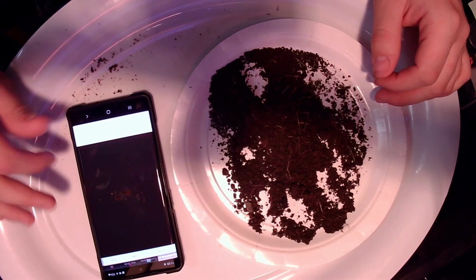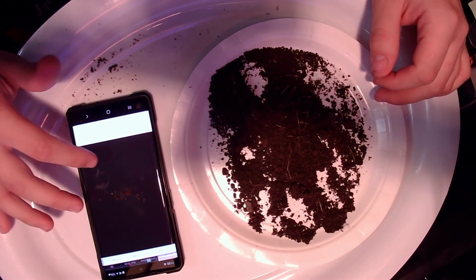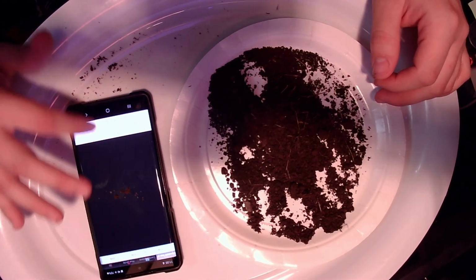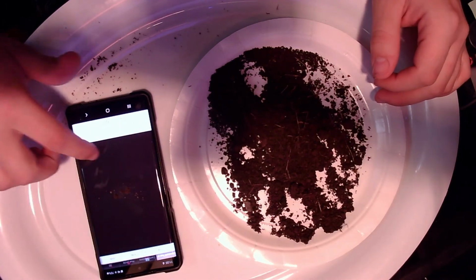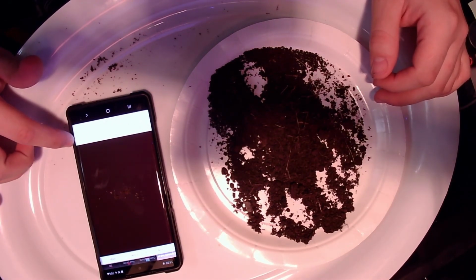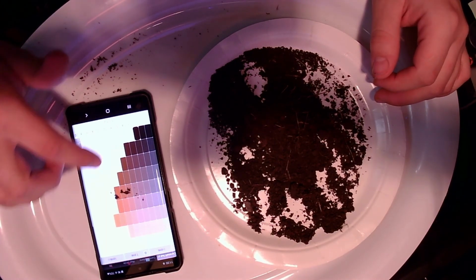Yeah, I think that's too much yellow in there. So let's go back to the 7.5. Find our current contender for best is 7.5YR 1/2. So that's the current best.